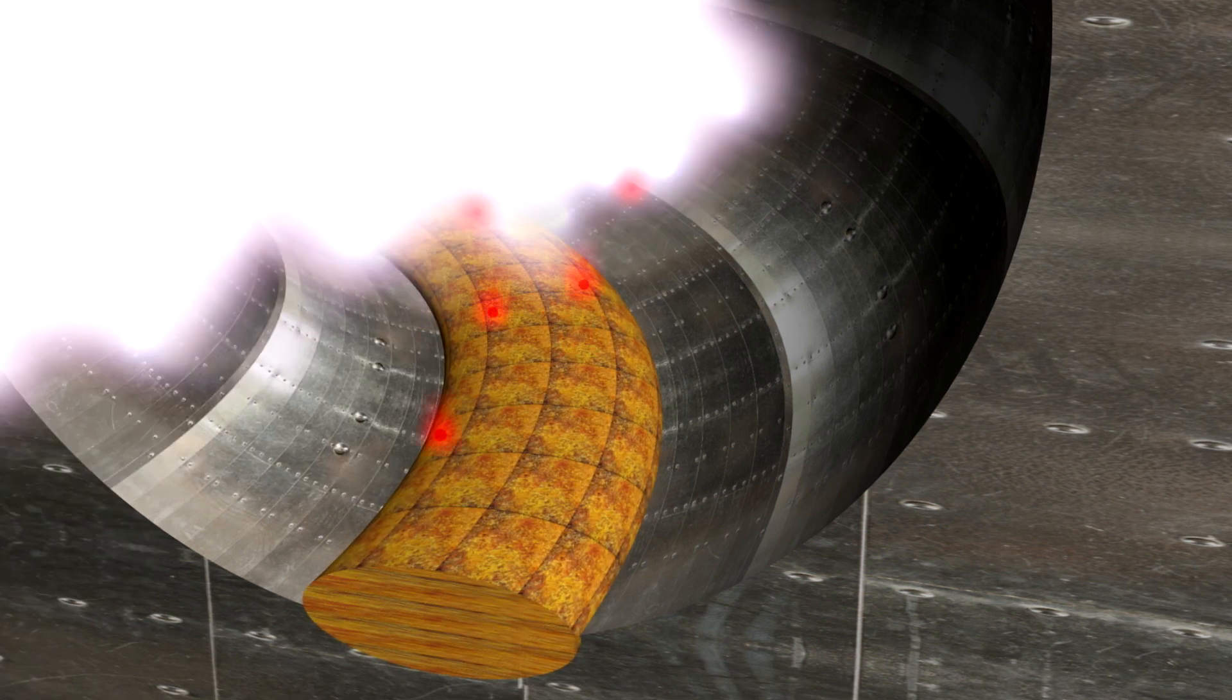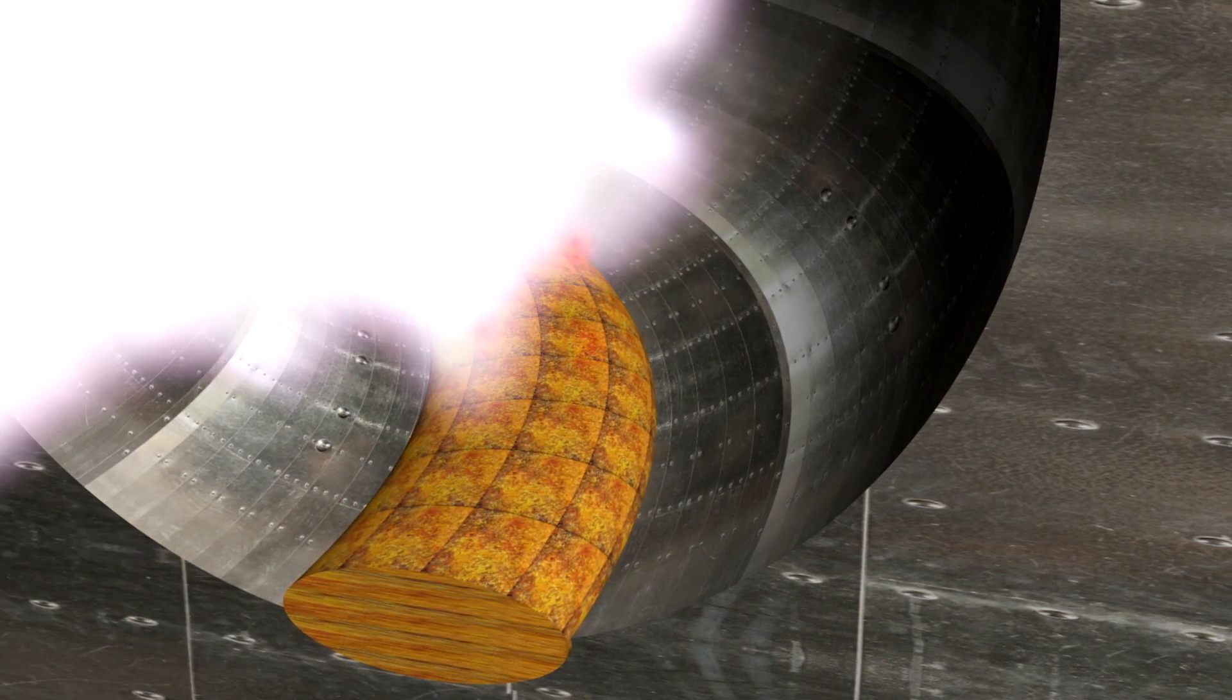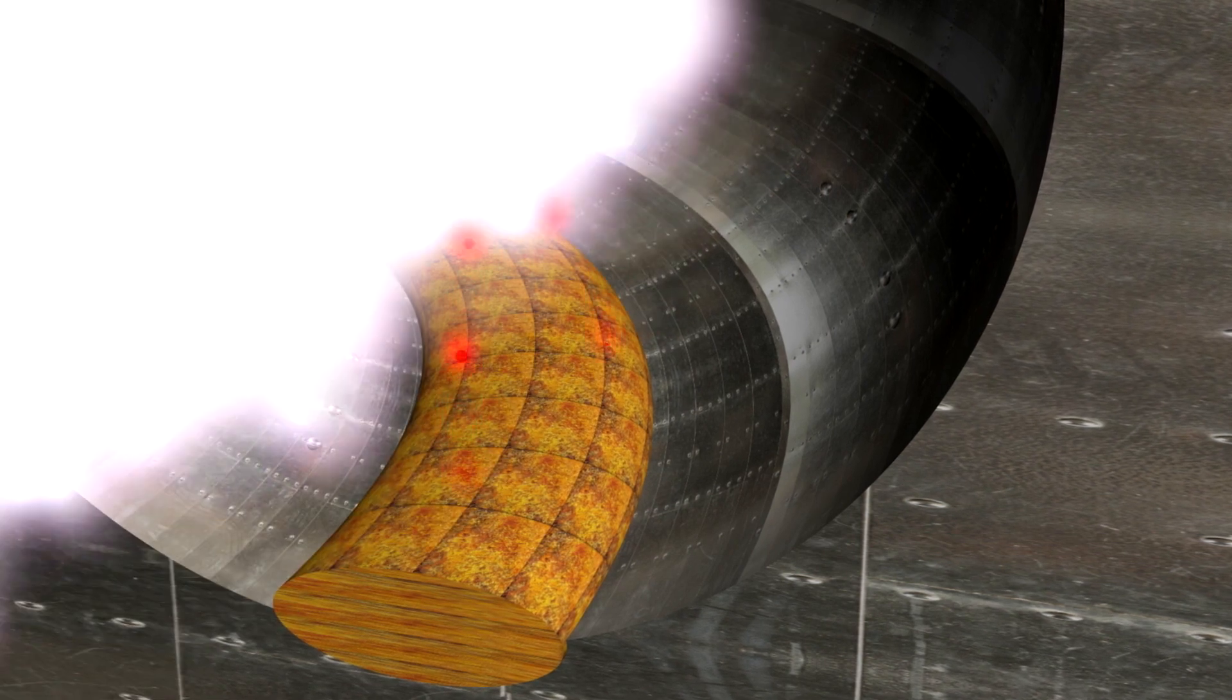Therefore, diverters are used to remove this contamination from the system by absorbing the energy of heavier high-energy ions that are violently ejected from the main plasma. One of the few materials that can withstand these extreme conditions is likely tungsten, and this is what the scientists are testing at the moment.